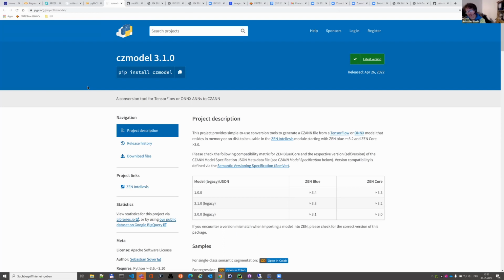Okay, I still have half an hour that I think will be a good fit. What we also learned over the last years, again with a focus on AI applications, is that in the AI business you always have to think about where you do your training and how you do it. Once you have your training done, you have a trained model, for instance for segmentation. That model can then be used, typically in a different software, as part of maybe an image analysis workflow to count cells, something like this.